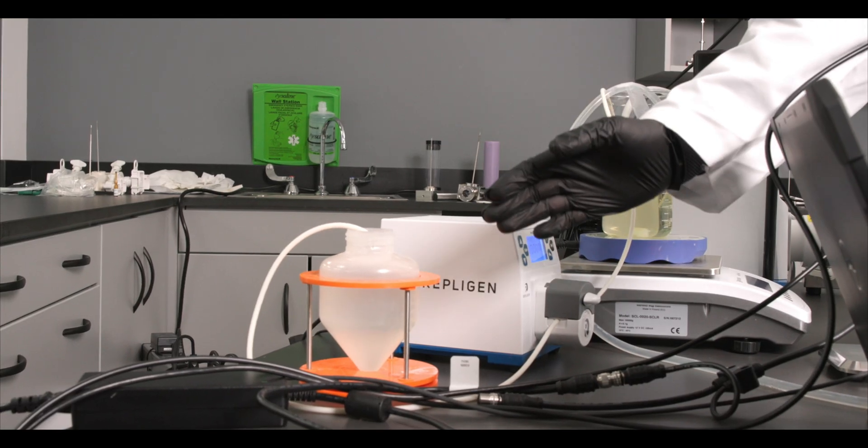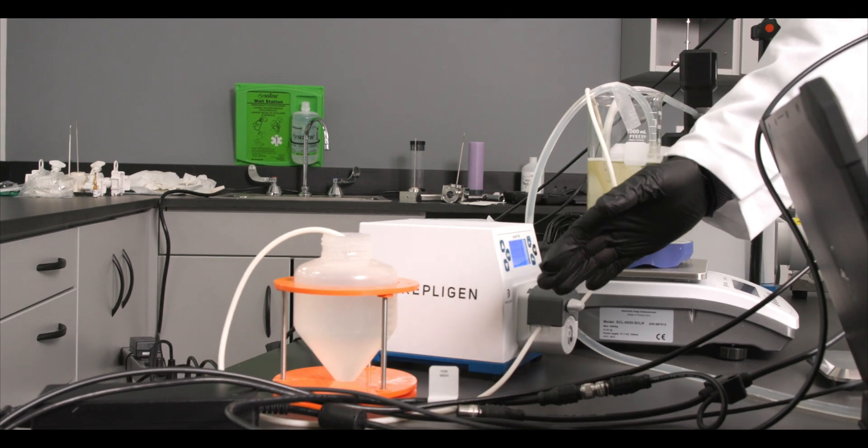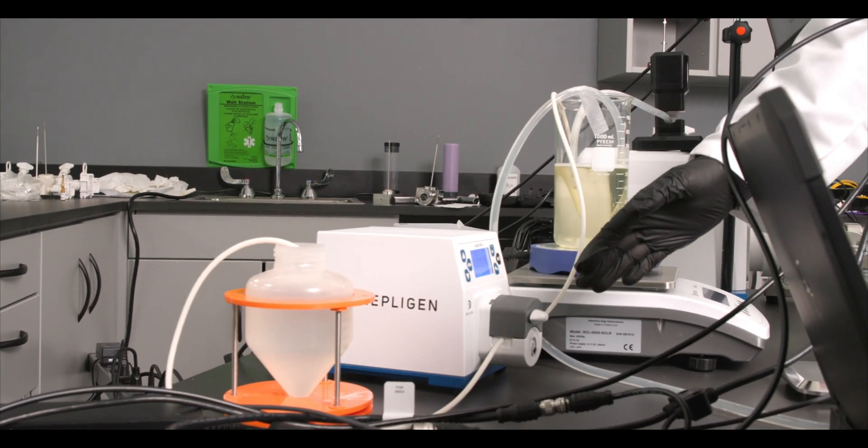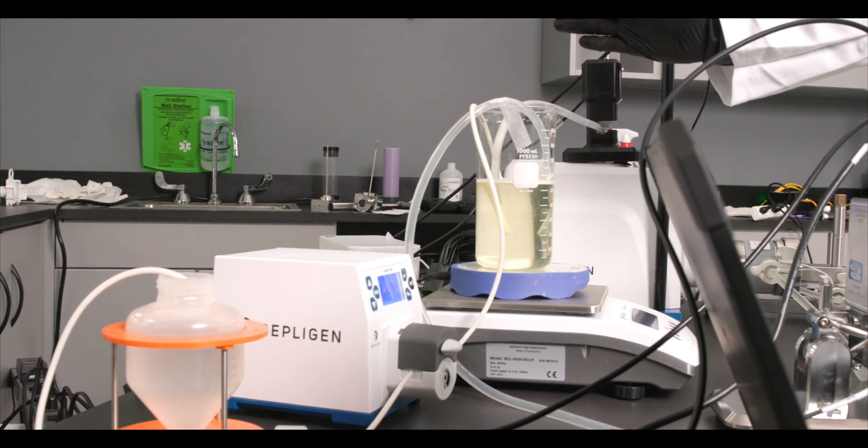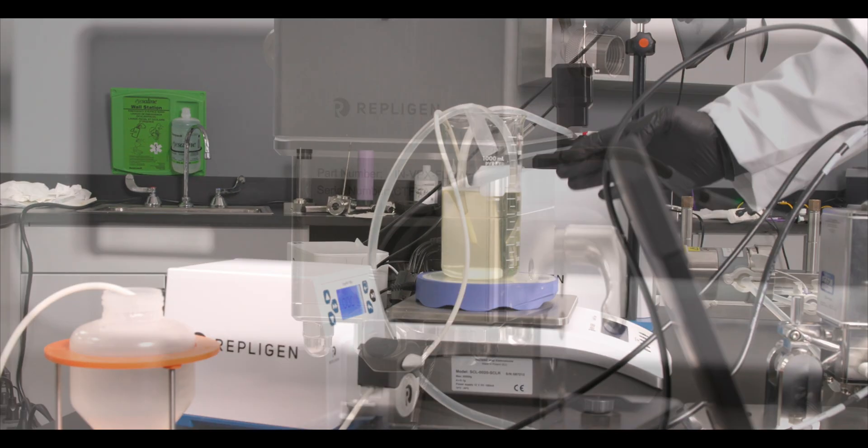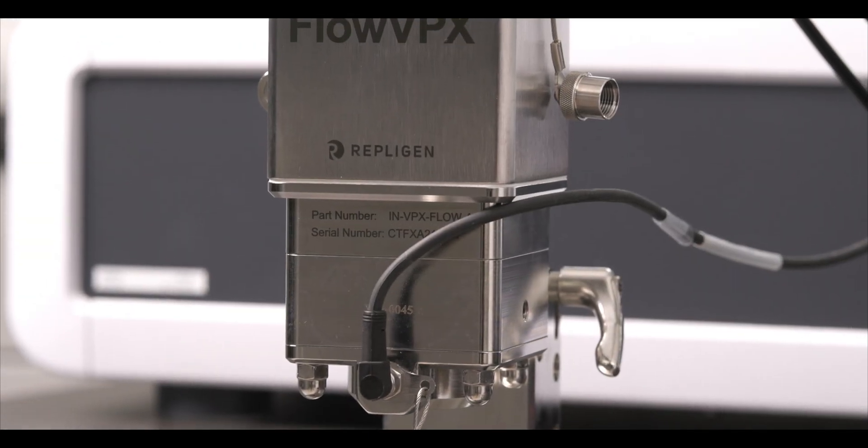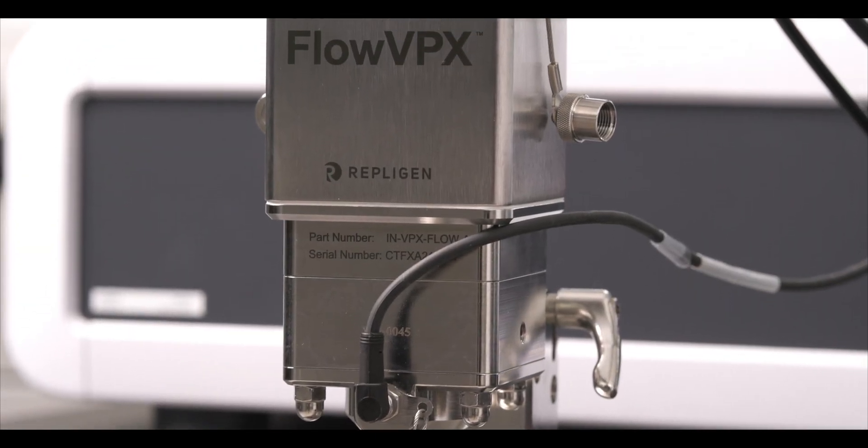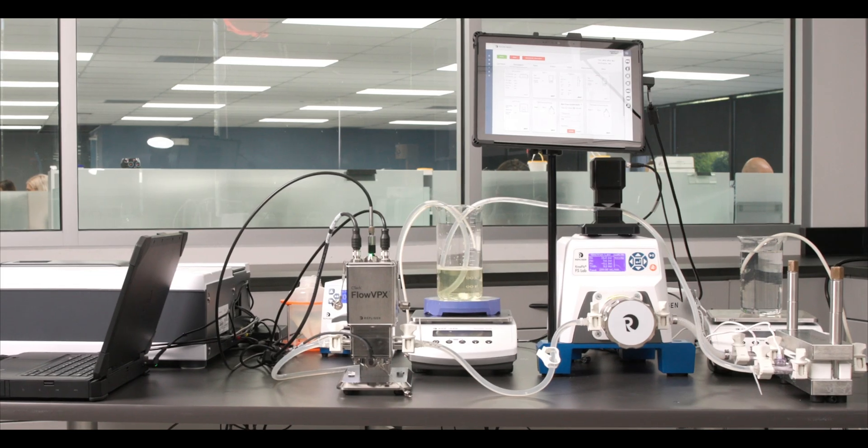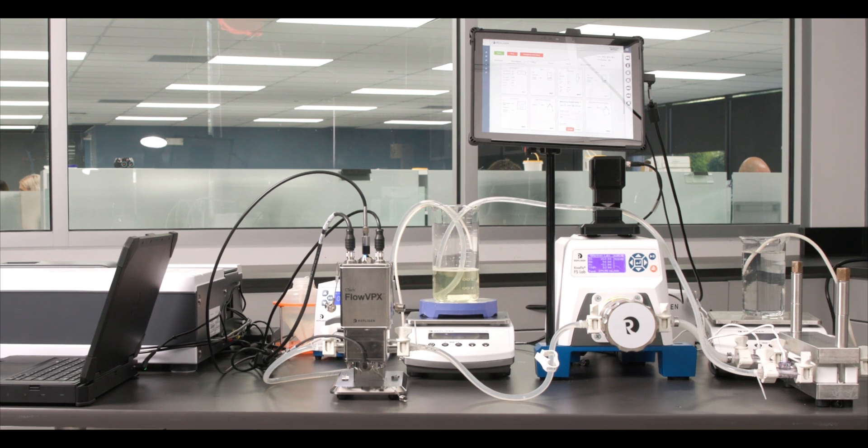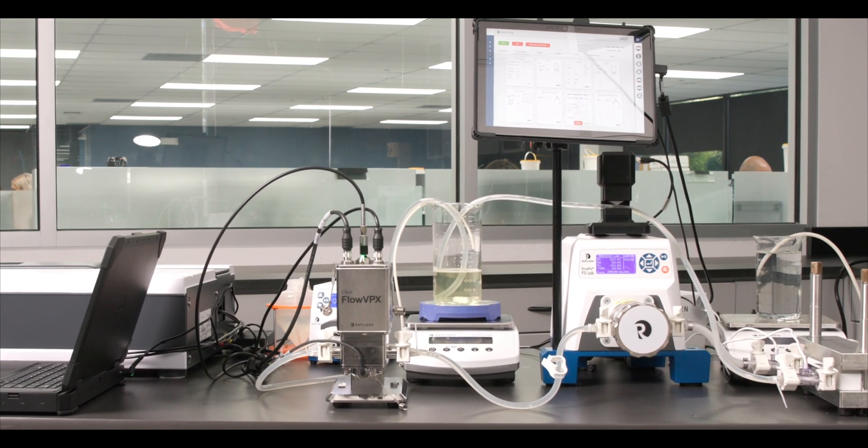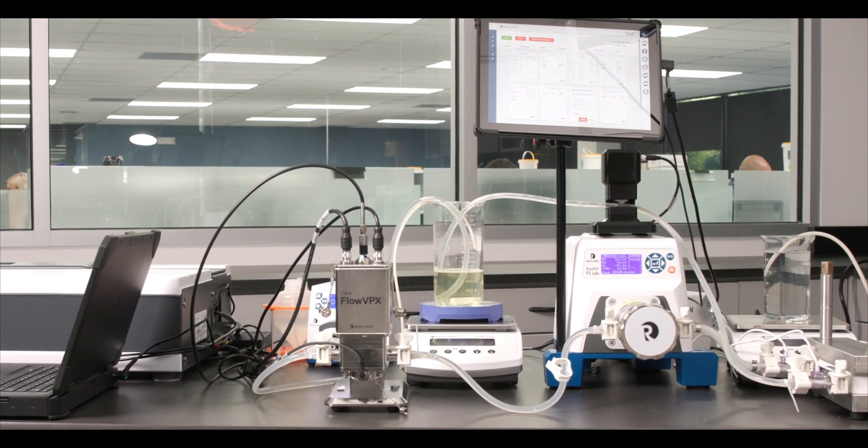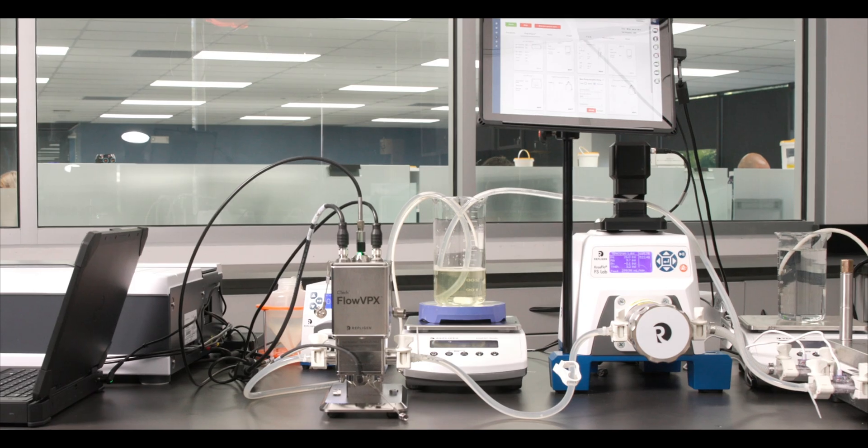Now that we have reached our desired concentration of 80 mg per ml we begin our diafiltration step. For users looking to automate their setup the FlowVPX system has open platform communication united architecture or OPC UA. Concentration thresholds can be used to trigger the next steps in your operation.